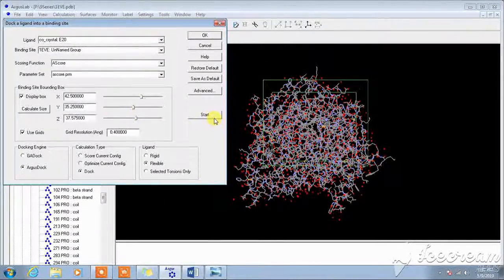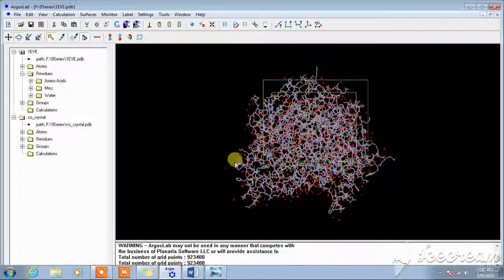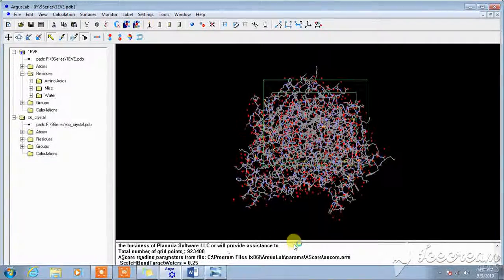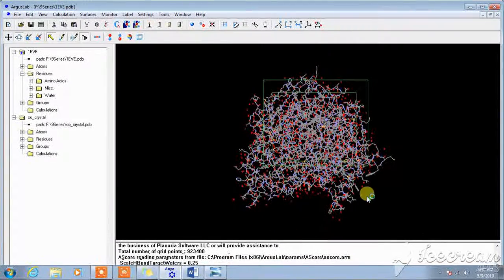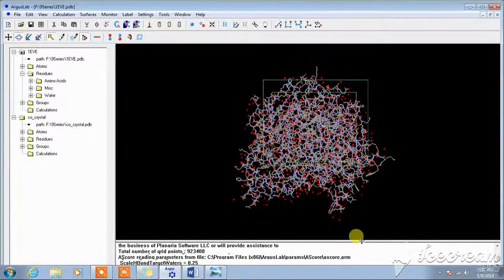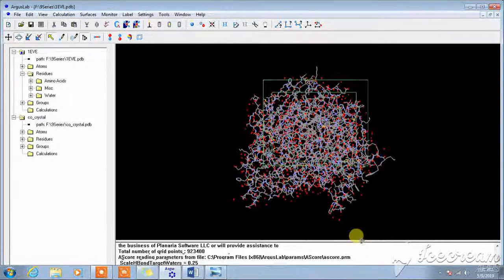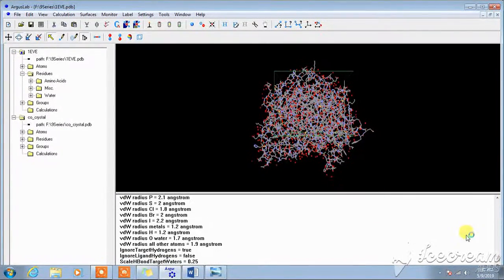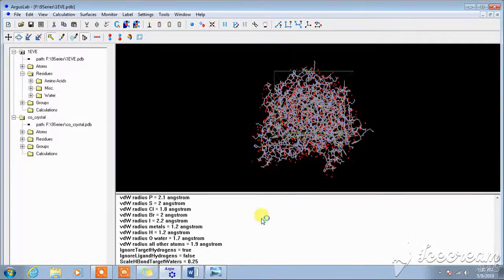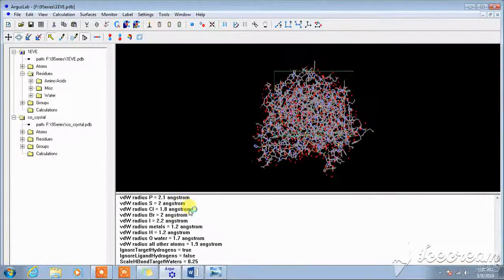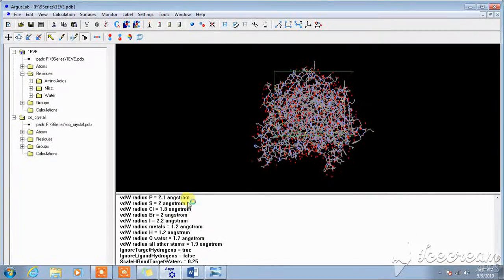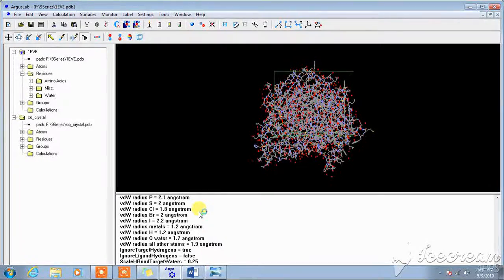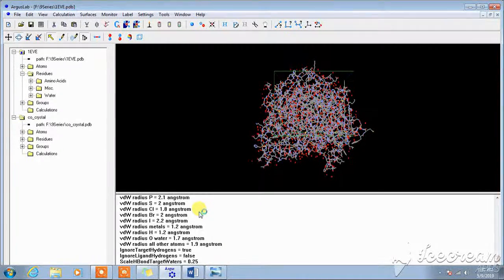Start. See, this is their calculation part. Now these are their calculation part. Docking is going to perform, so the calculation is written on this page.